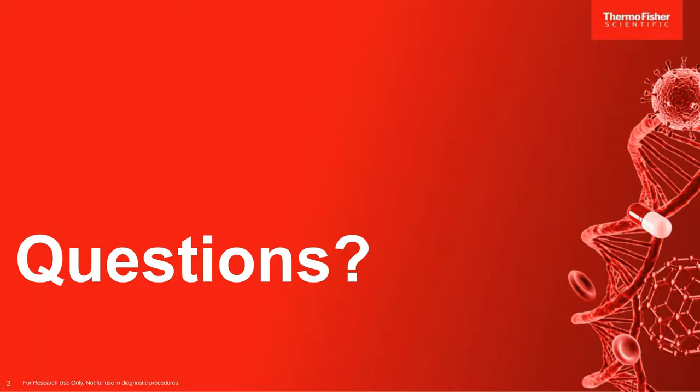When I see what I suspect to be poor fixation at another analyzer system, I will take them over to the CytPix just to have a quick view of the cells and see if there is any compromised fixation of the samples. So no, there's nothing special that you have to do with these samples to take these images.